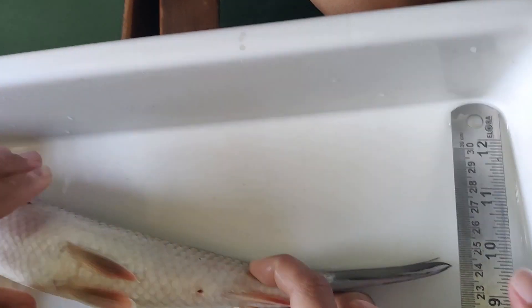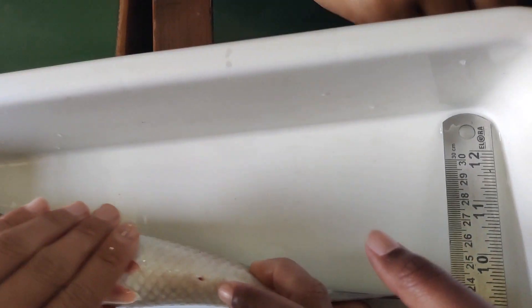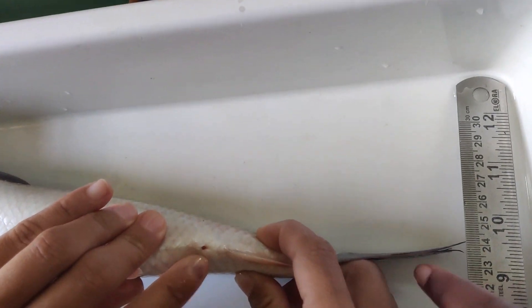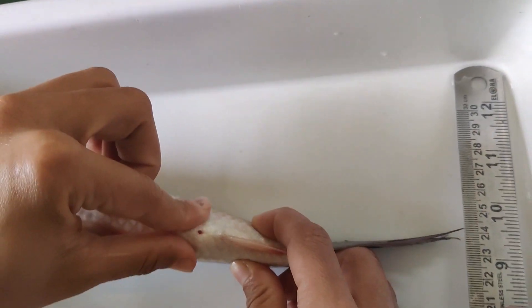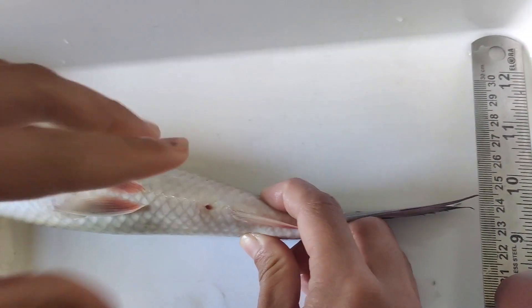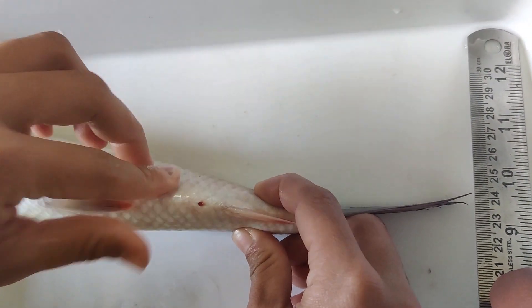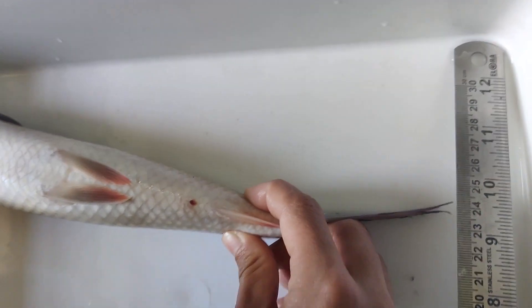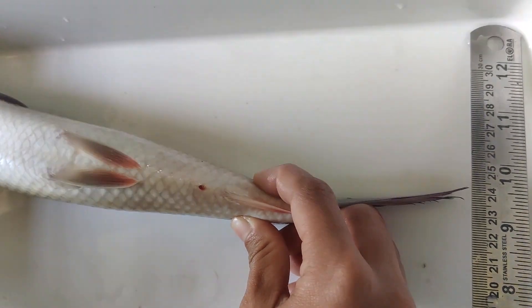This is the female skin, and this is the male.